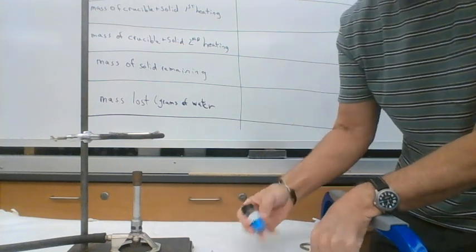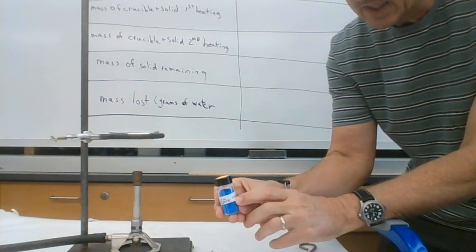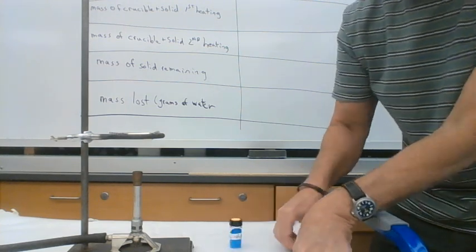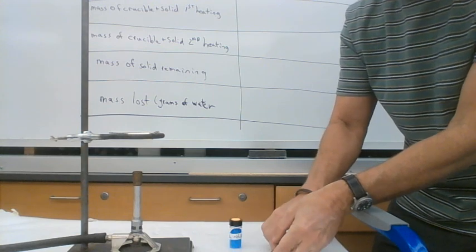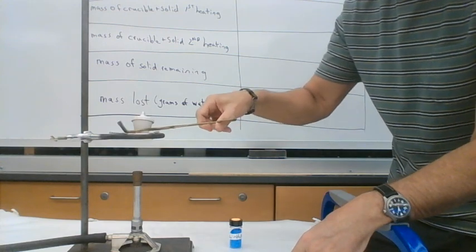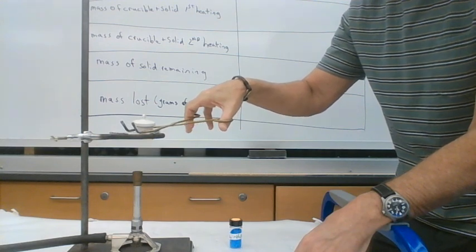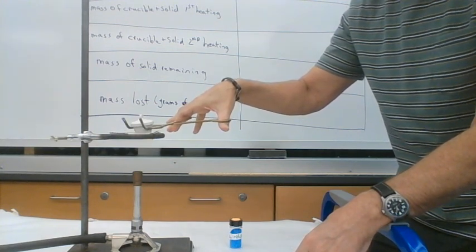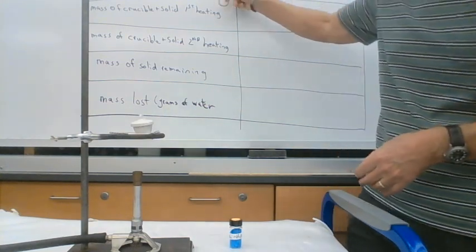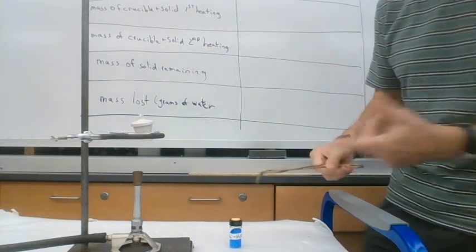Then what we're going to do is add about 2.5 grams of this copper sulfate that has an unknown degree of hydration to the crucible. So we pour that in there, and then we're going to come back, put this on the balance, and weigh the crucible now that it has the hydrate in it, as well as the weight of the crucible. And the difference between those two weights will give us the weight of the material in the crucible. So we have the mass of the crucible empty and the mass of the crucible with the hydrate in it. The difference will be the mass of how much hydrate is in there.